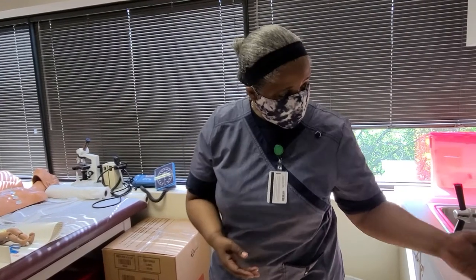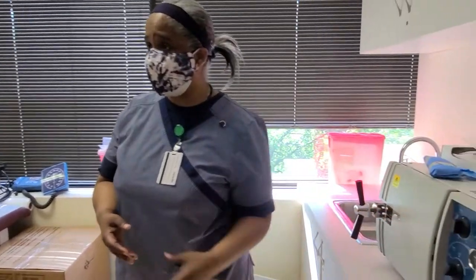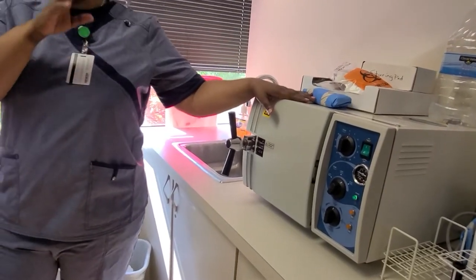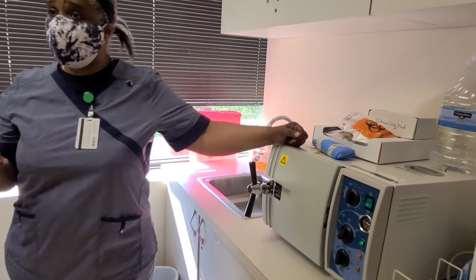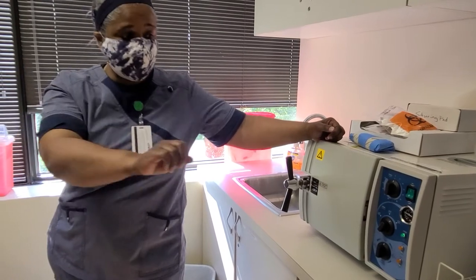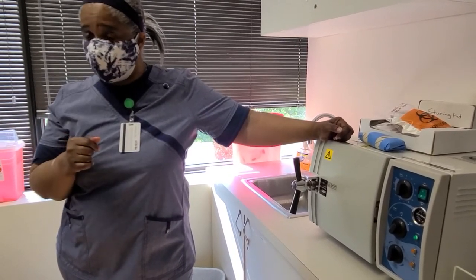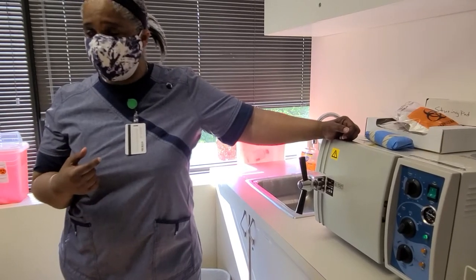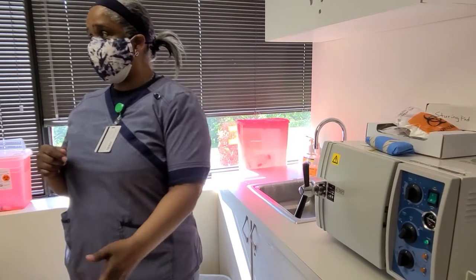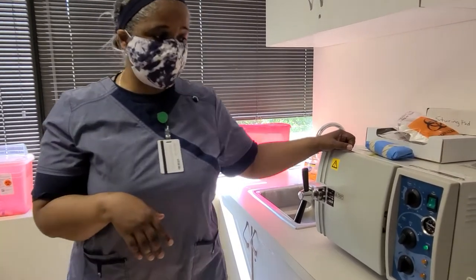Once I've set my temperature, now I'm going to set my time. When it's done, this one gives a little bell and it'll say ding, and then it's time for me to open it. But there are other ones that do not let you know, so you'll have a little timer and you'll turn that to make sure you don't mess up. And you also need to watch this. Don't do what I did, where you walk away trying to do five things at one time and now the water comes out because you misjudged it. So you need to really watch this so that you don't create a mess.